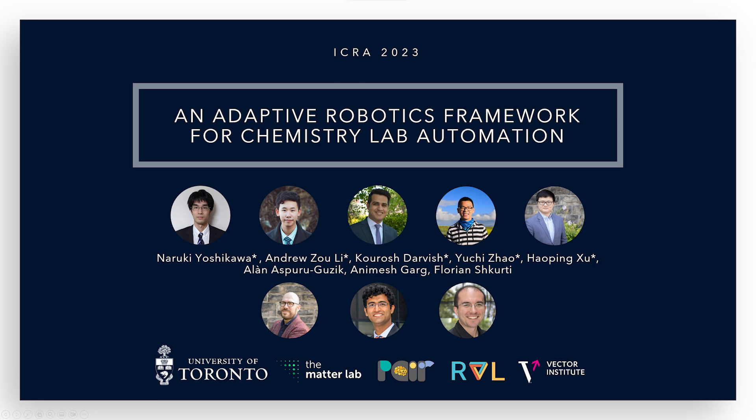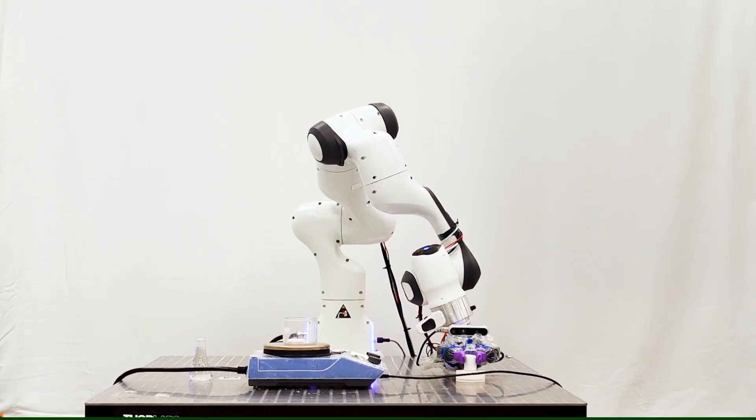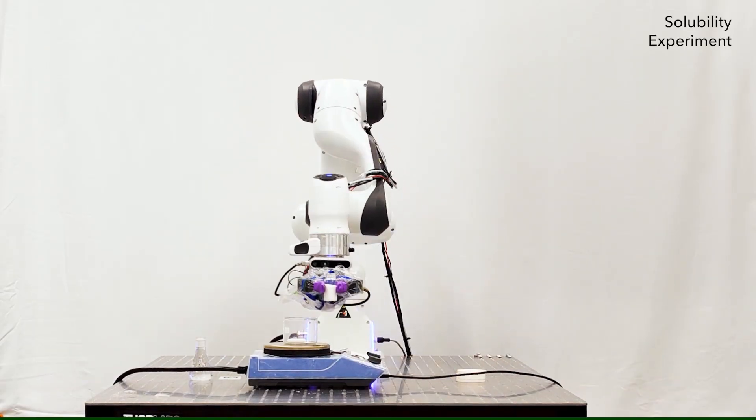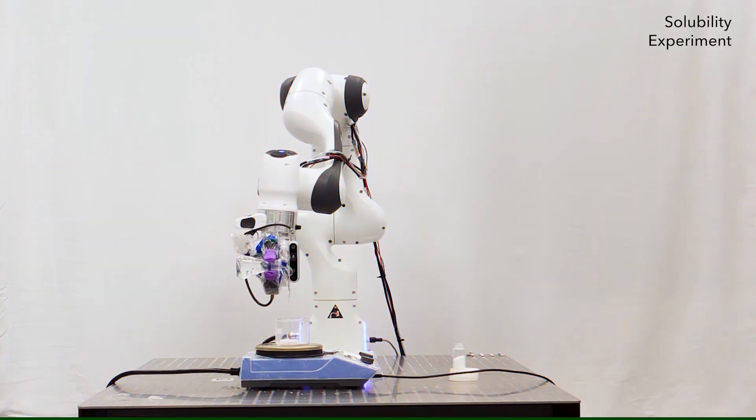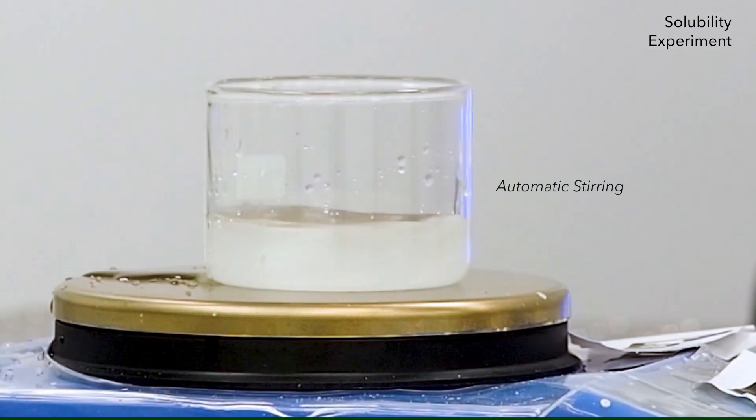We propose an adaptive robotics framework for chemistry lab automation. The proposed framework facilitates material discovery by using robots to help chemists through automating laborious experiments that are often dangerous. We verify the utility of our framework with several chemistry experiments, including solubility and recrystallization.